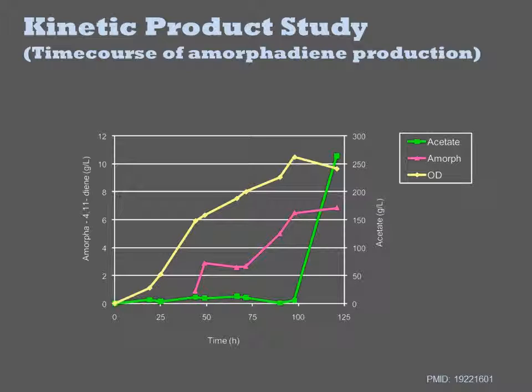In the previous endpoint experiment, the goal was to compare two different strains. In this experiment, the goal is to characterize a single strain in the context of a scaled-up bioreactor by varying the different conditions for the fermentation. They want to know how to optimally run the bioreactor to maximize product yield.